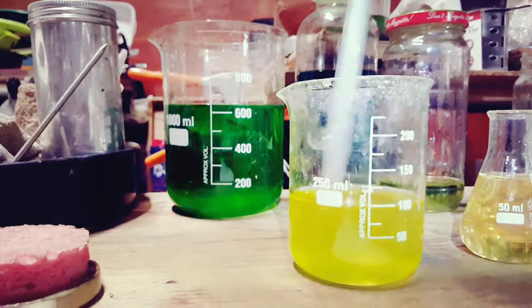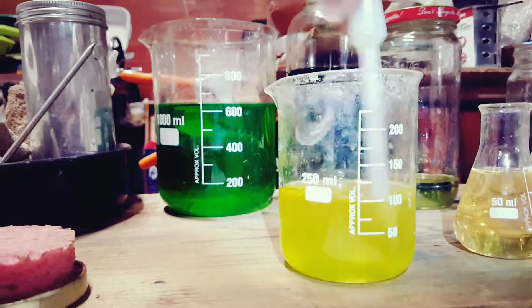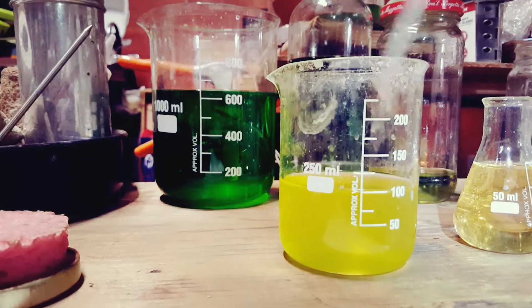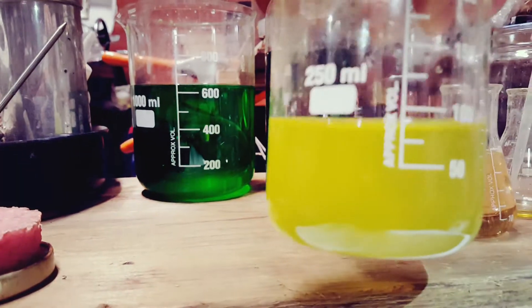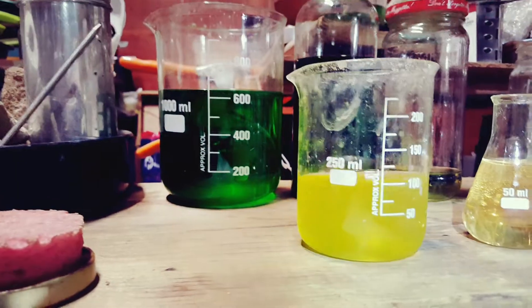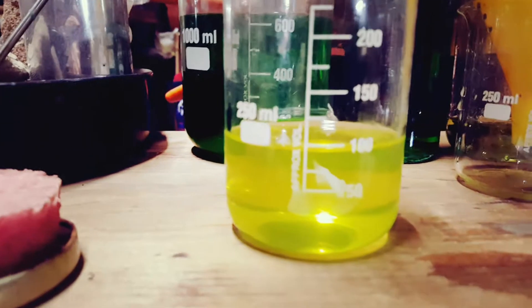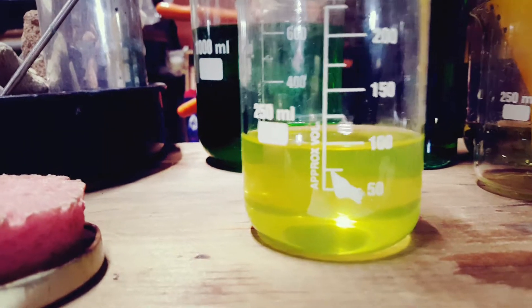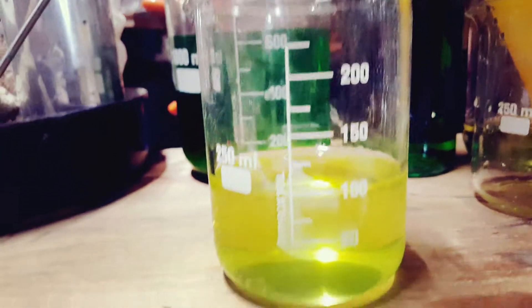Six drops should do. I'm just going to wait a few minutes and see what happens. I went ahead and refiltered it just to make sure it didn't leave any lead in there. It didn't look to be any lead, but you never know.